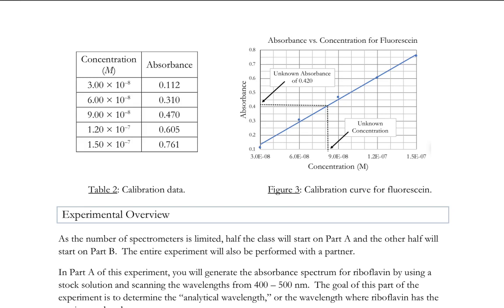That's our dilution equation. Where in our dilution equation, M1 is the stock concentration, V1 is the volume, 2 mLs or 4 mLs or 6 mLs or 8 mLs or 10 mLs.